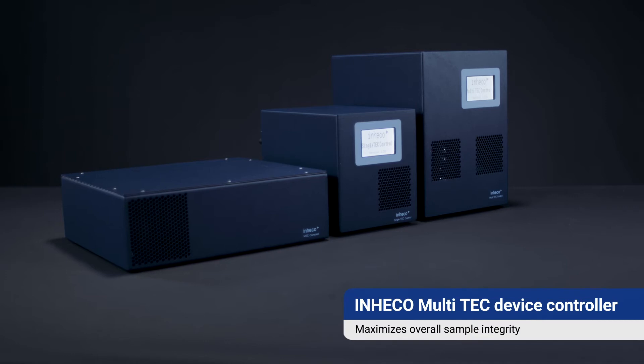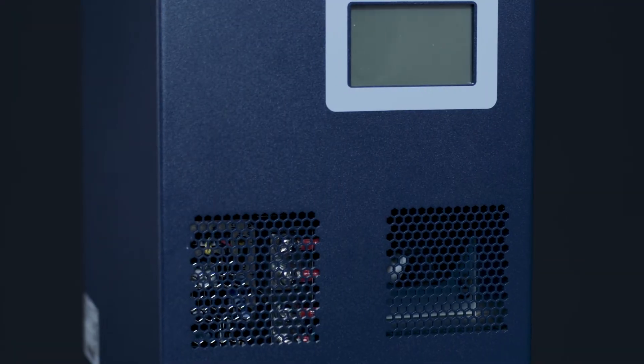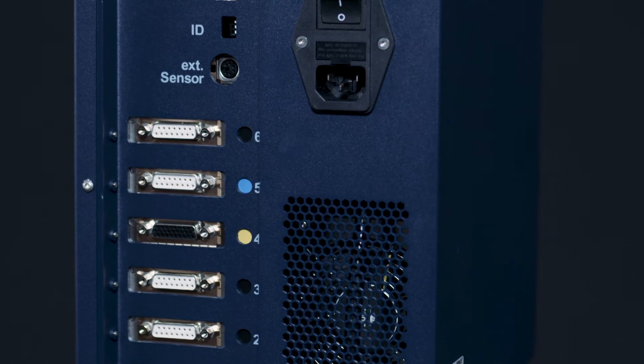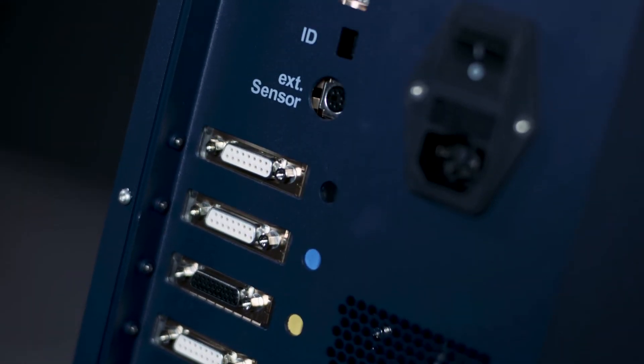The separate off-deck control units further minimize on-deck space, noise, and temperature generation. When multiple INHECO products are in use on a deck, INHECO's Multi TEC control unit can control up to six devices in parallel.